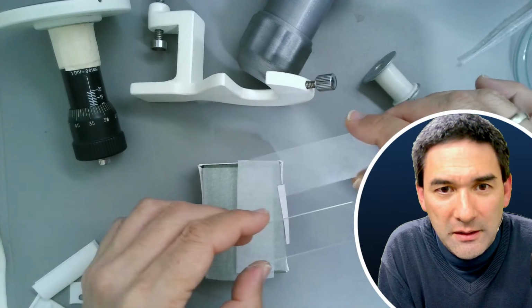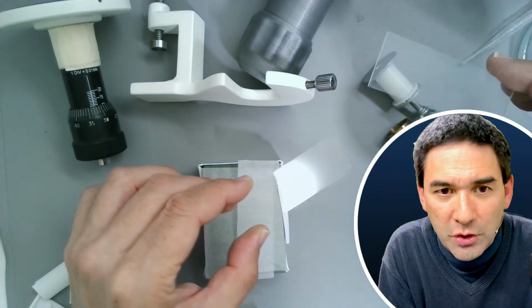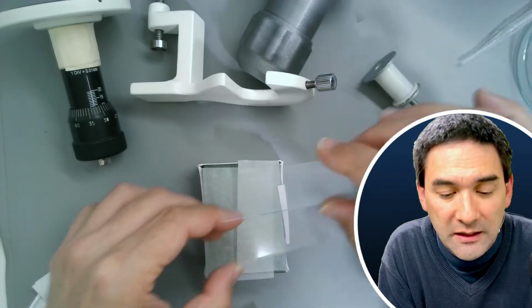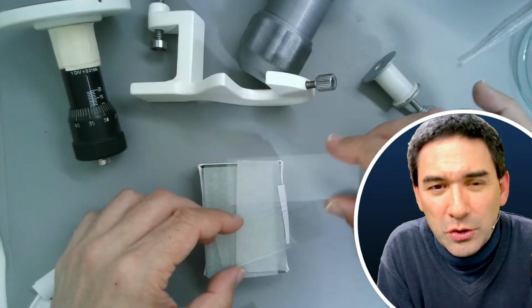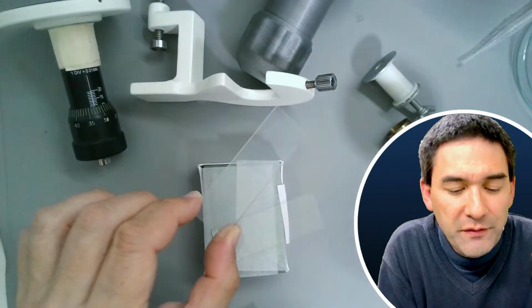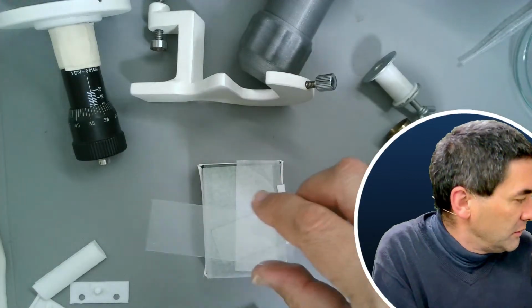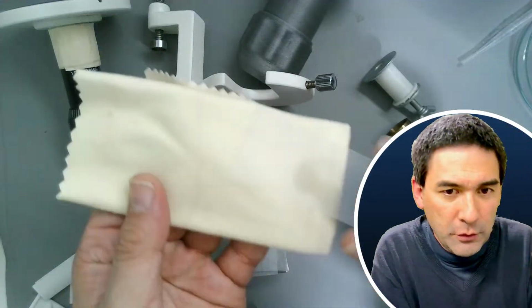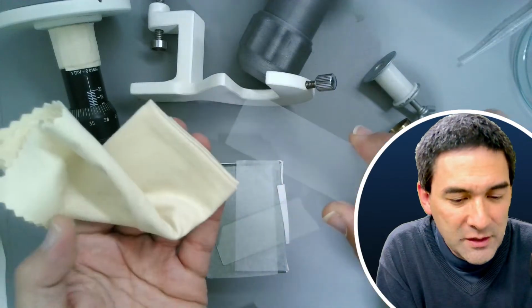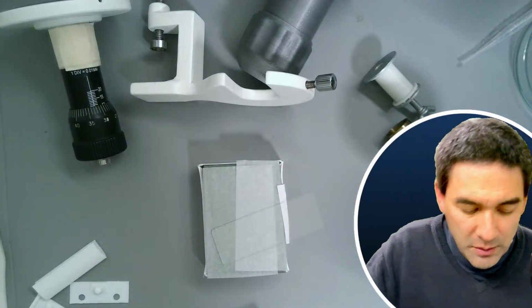Just hold them up. This one here is so much shinier, and this one is really clean. The other one, it's not dirt really, but this is residue on it, which is also very difficult to remove. Usually I'm using some kind of tissue paper, or you already know my microfiber cloth. Even with that, it's not possible to remove it. So you've got to treat it with some vinegar or some other weak acid.